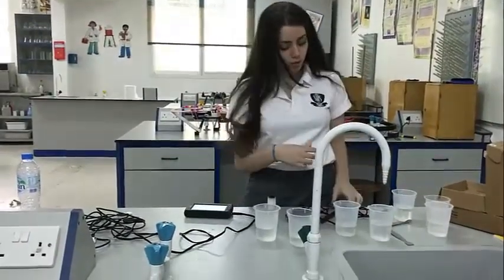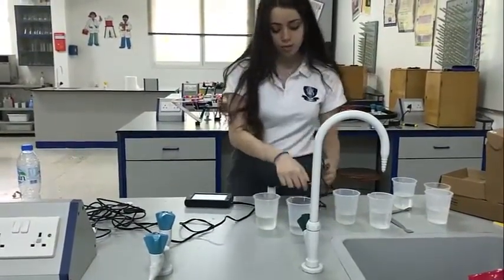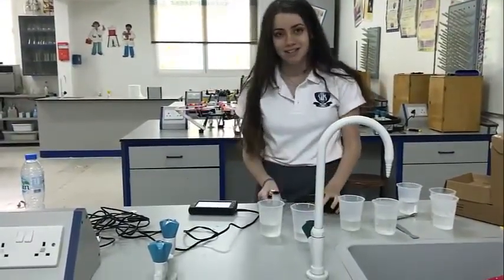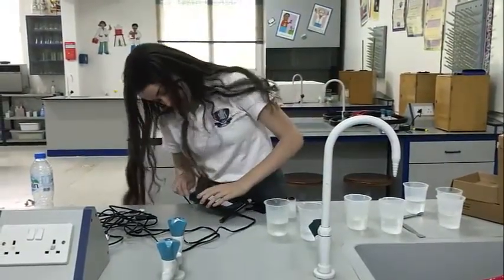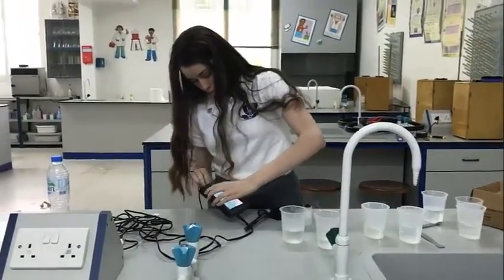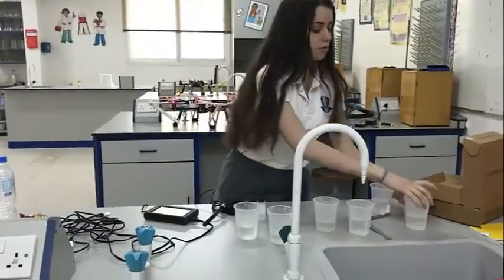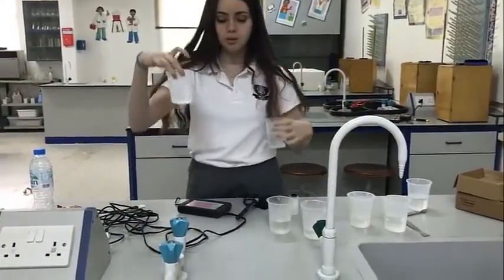And by that we're going to add salt. As we know, the more salt in the water, the more conductivity it has. The less salt, the less conductivity. So this is the one with salt, and this is the one without salt.